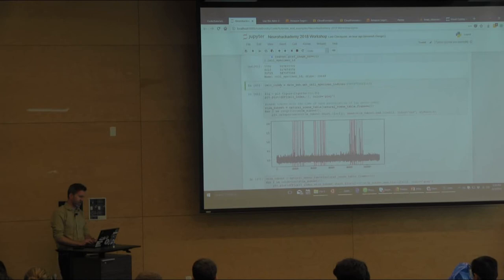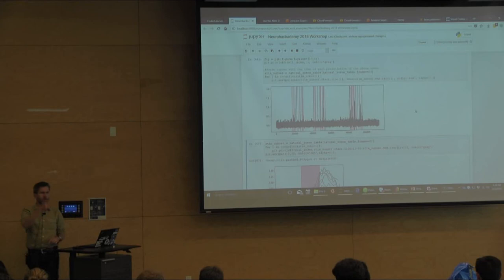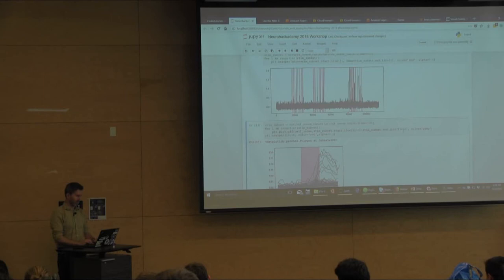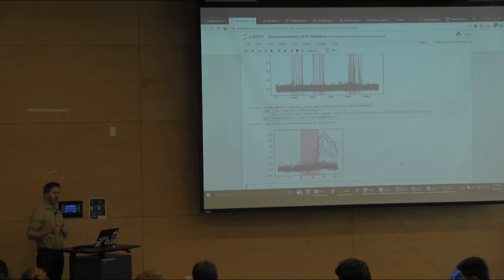And so now we can plot just that cell instead of all of the cells, as well as when the image was presented. And then we can flip it around and say, okay, for each presentation of this image, what's the average response? What's the response of this cell? And we can extract the local DF over F response to a given cell. Any questions at this point?